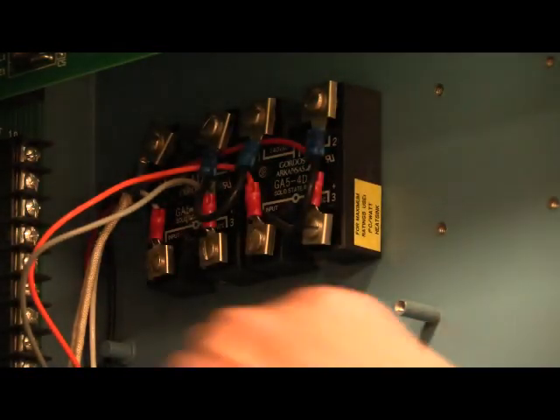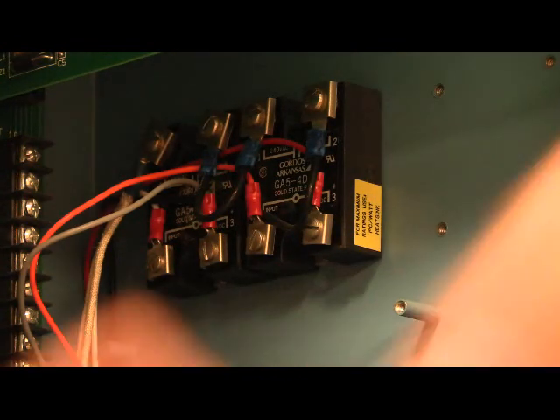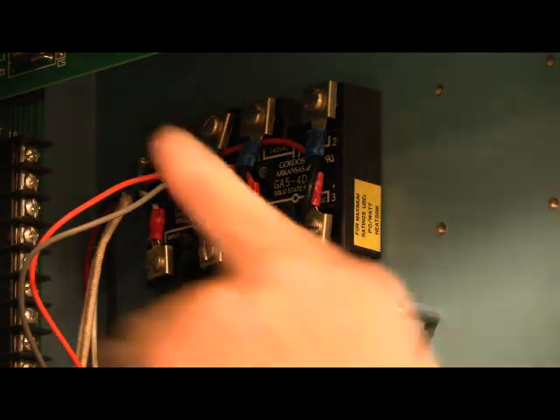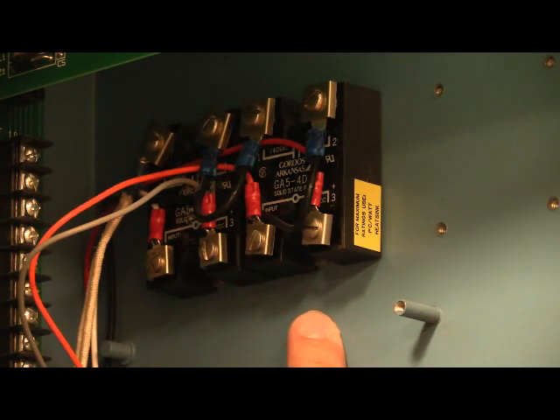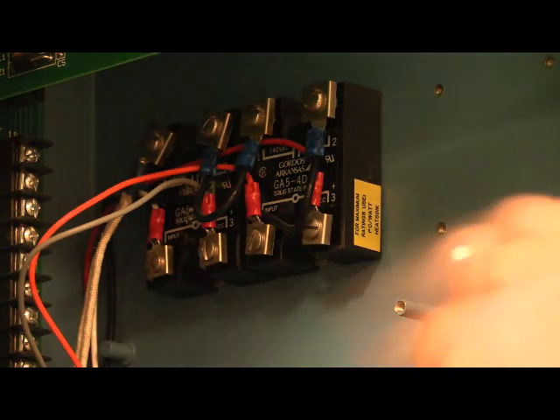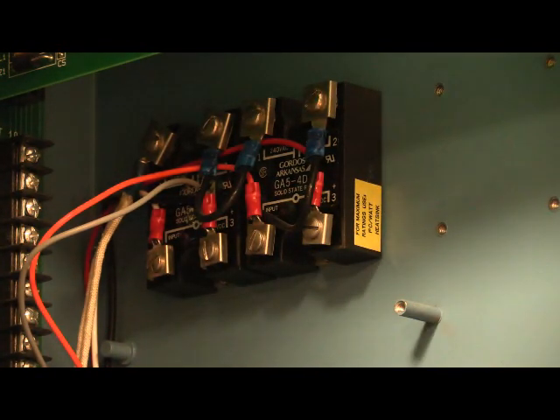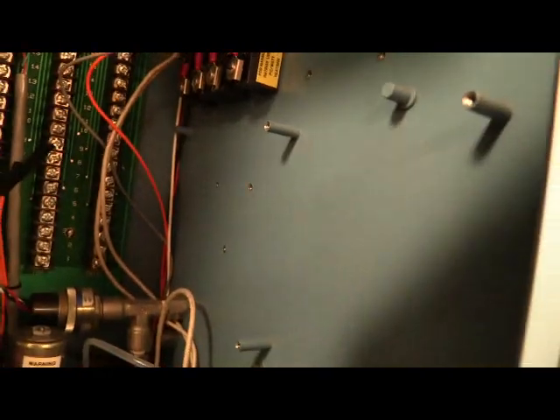The relays are for sending the voltage, 120 volts, down through the heater. Since the electronics can't really handle doing the pow, pow, pow of sending that 120 volts open and close, open and close, you utilize relays. So you send a small DC voltage to the bottom of it, and whenever it gets that DC voltage, it opens and closes that relay. On the other side of the relay, it opens and closes with the opening and closing of this side, allowing the 120 volts to flow through and go down and warm up the heaters. Pow, pow, pow, pow. See how the wires come off of it?